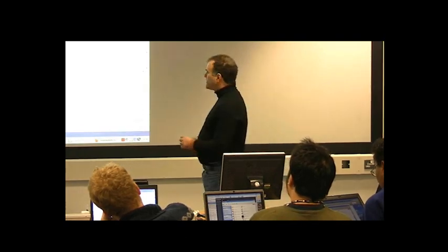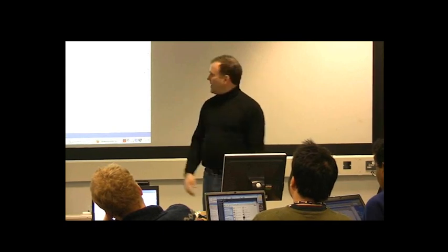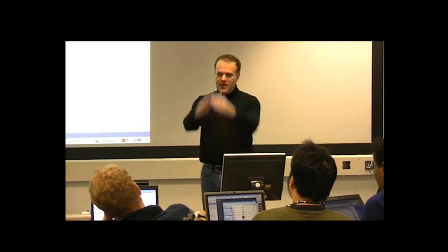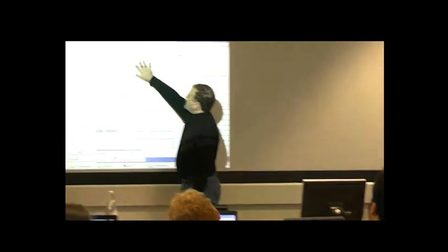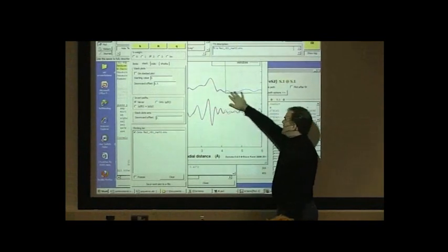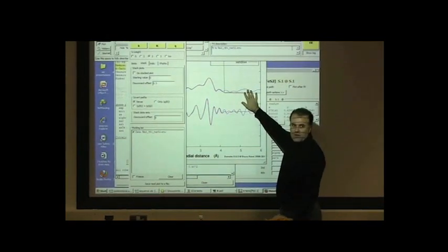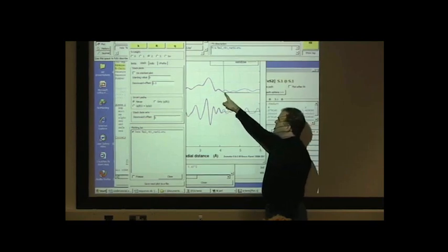So that's a little bit of a difficult question to answer completely generally, because as you saw from the stacked plot, everything overlaps with everything else, and everything has long tails. And whatever stuff is out here actually bleeds back a little bit. So as long as you're not including all the stuff out here, it's hard to know what exactly the right point is. And if you're not including all of this stuff, it's hard to argue that the fit should be there or there or there. You can't really make a good argument about that.